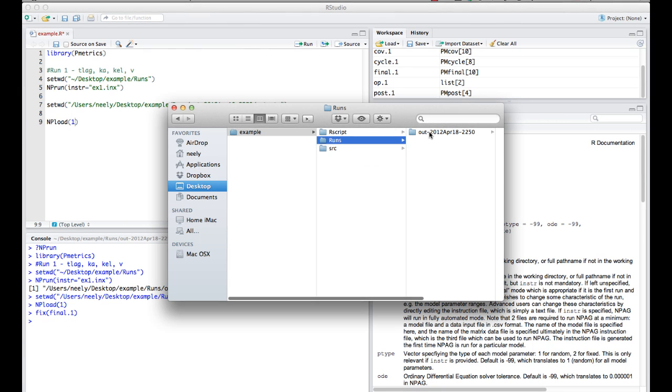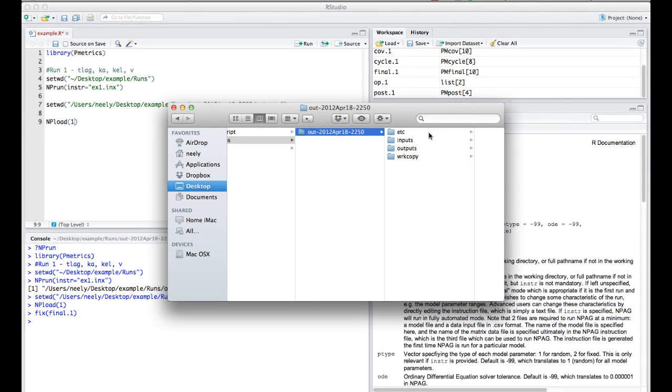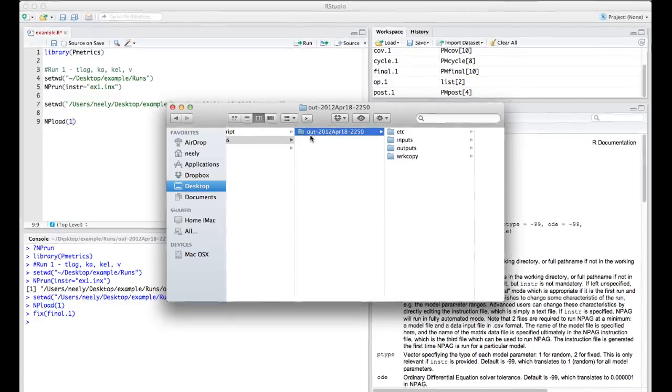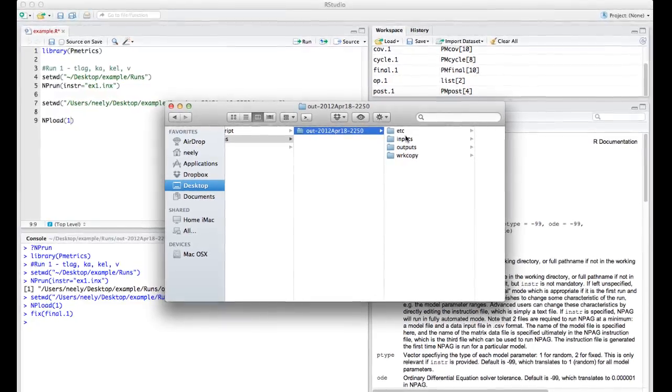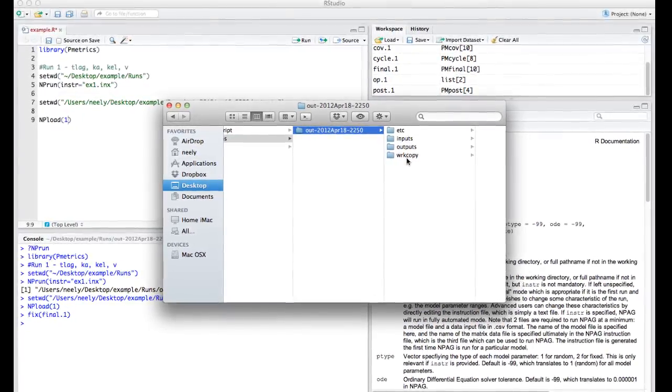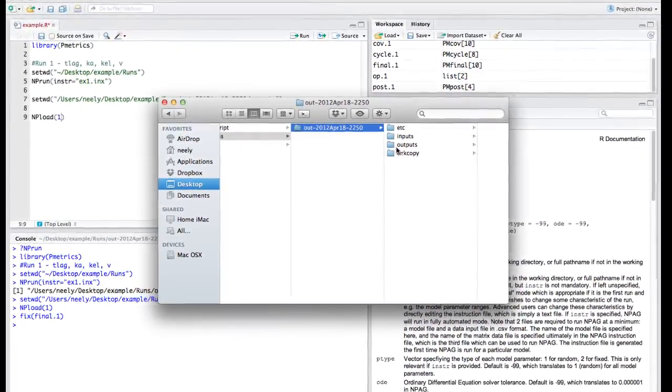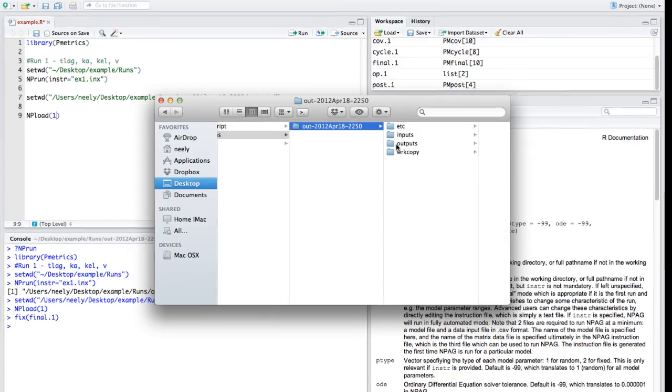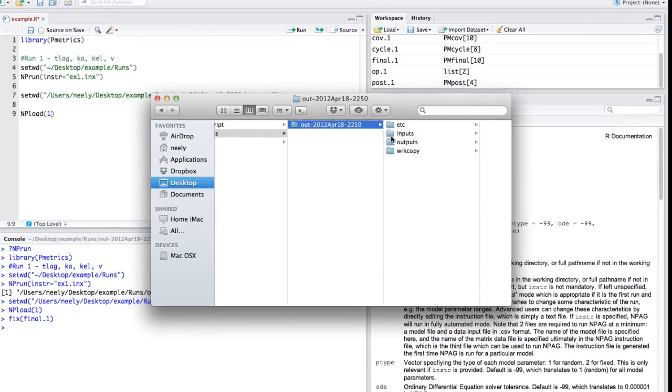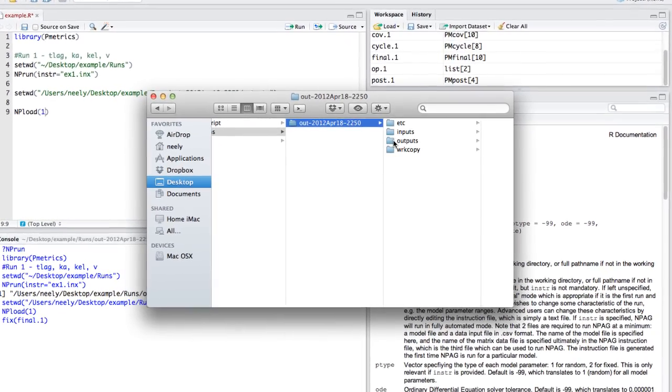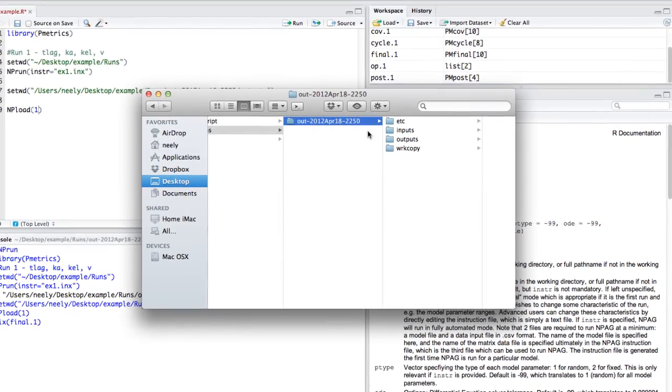If we go now to our folder, we can see that we have a new output directory that is time and date stamped with the four subfolders that contain all of the data files, either that were inputs or outputs.